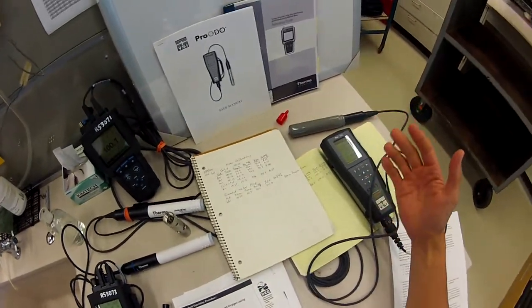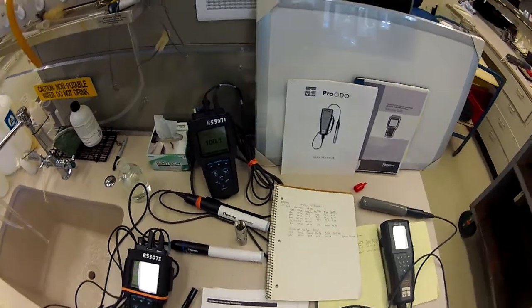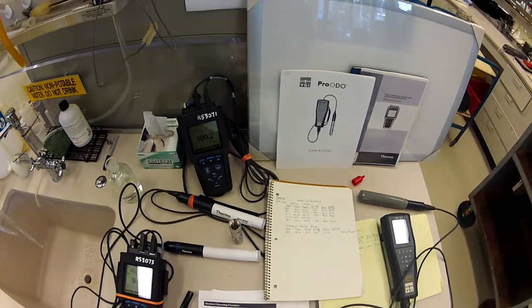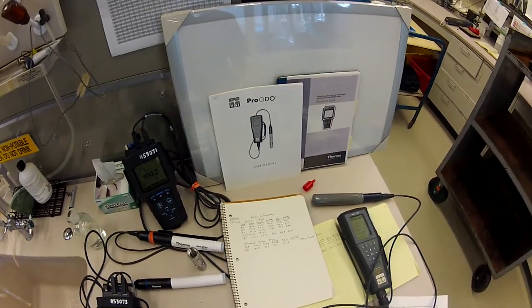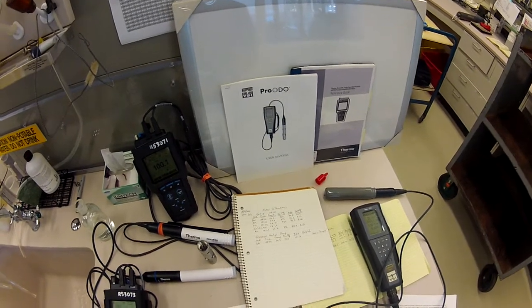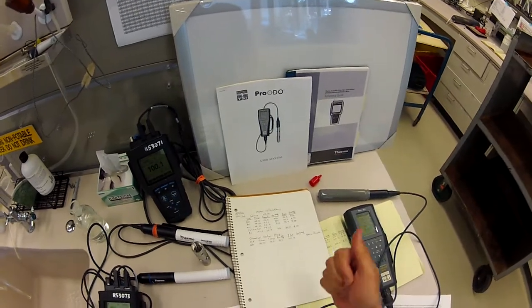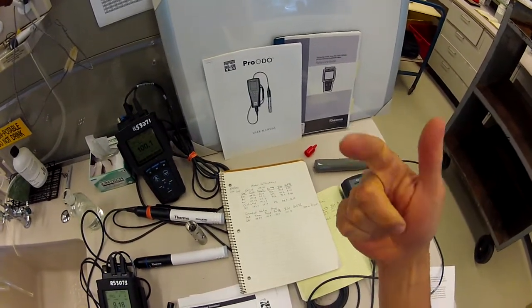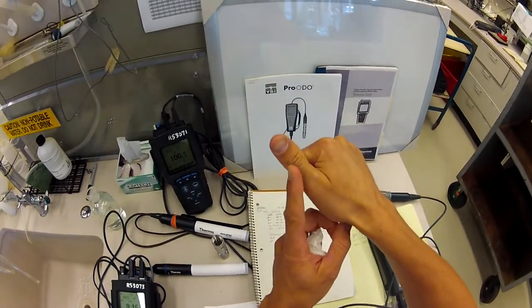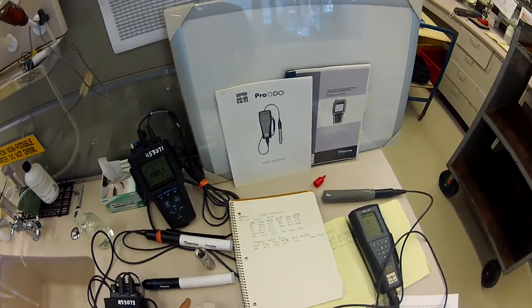Likewise, if the environment itself is changing rapidly, it's going to be difficult to get a stable environment that is a stable saturated concentration. The concentration is dependent on barometric pressure and it's dependent on temperature, and if the temperature is moving up then you're going to be having a hard time reaching equilibrium, or if the temperature is moving down, same thing.